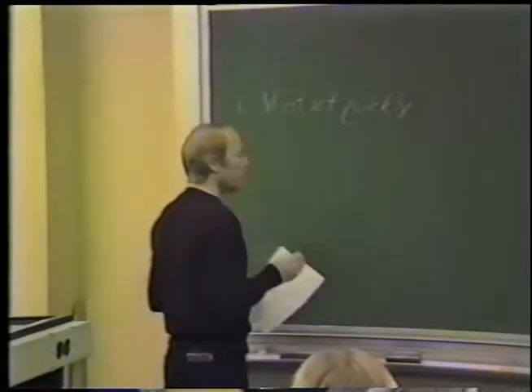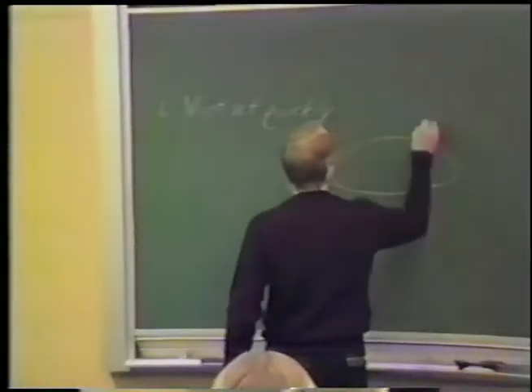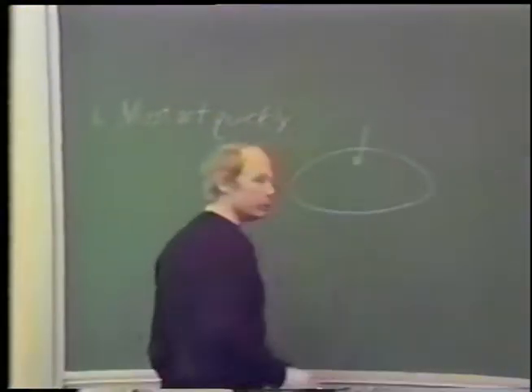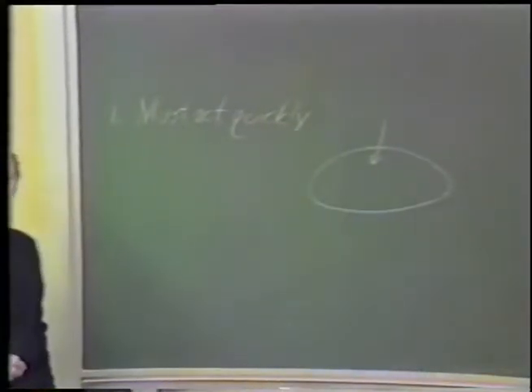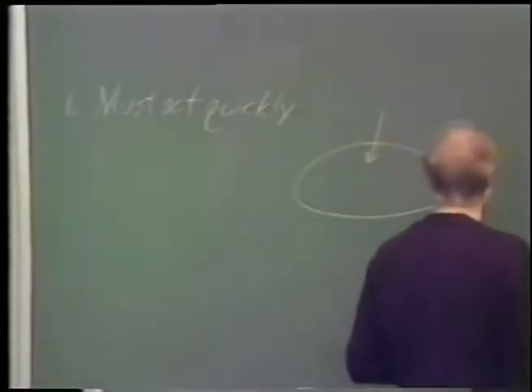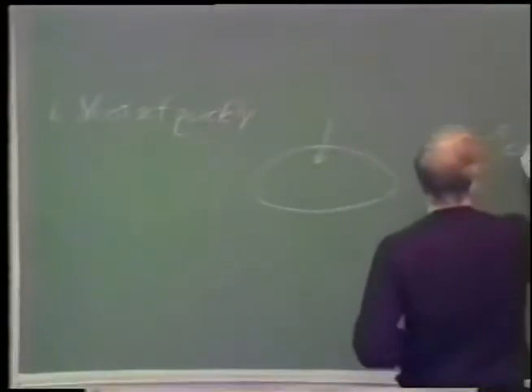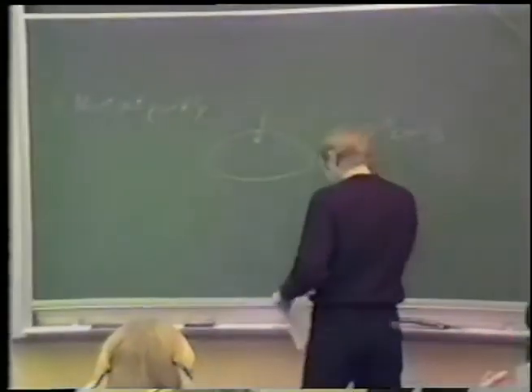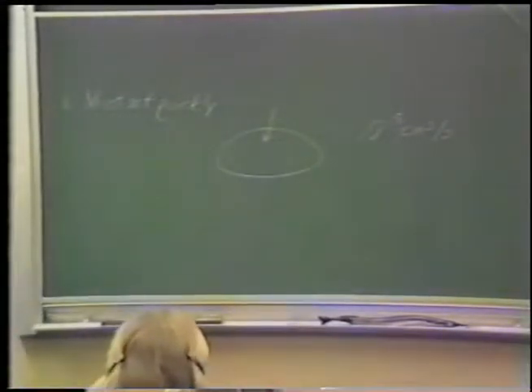Well, any chemical fixative has to enter a cell or a tissue, whatever the sample is, by diffusion from the outside. And diffusion is a relatively slow process. One can do a simple calculation based on a diffusion coefficient of 10 to the minus 6 centimeters squared per second, which is a reasonable value for the small molecules that fixatives generally are.